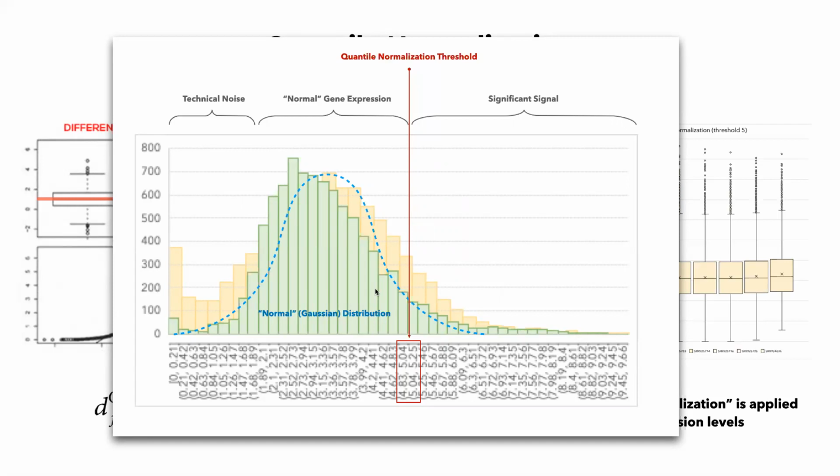So these are two methods. The first is log normal transformation, which is really scaling of the data and produces a different scale: instead of the normal scale, it's going to be in logarithmic scale. And the second one is quantile normalization. There are other normalization methods as well, but in our case, we can rely on quantile normalization so that the power of a test that we will perform downstream is going to be more significant.